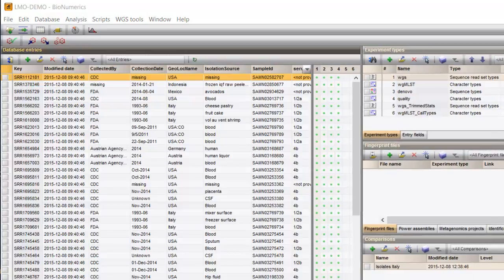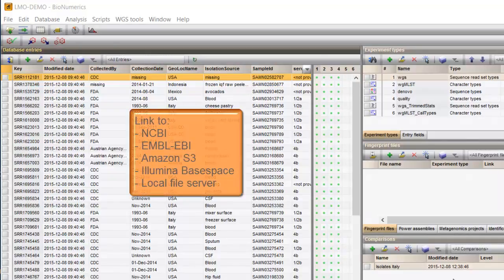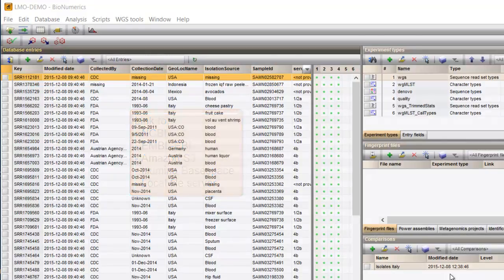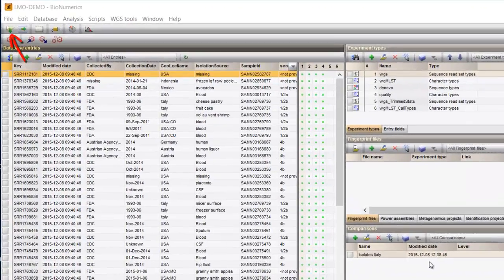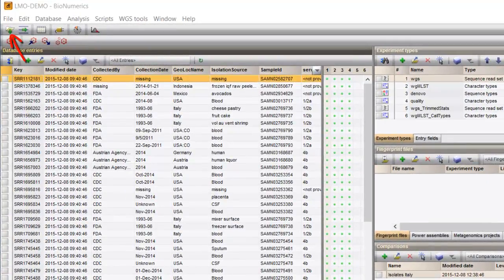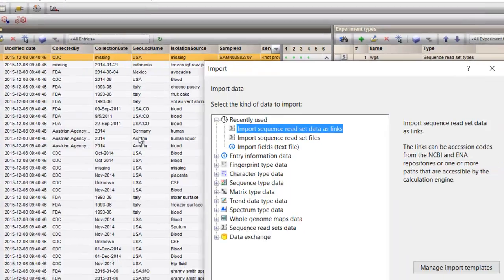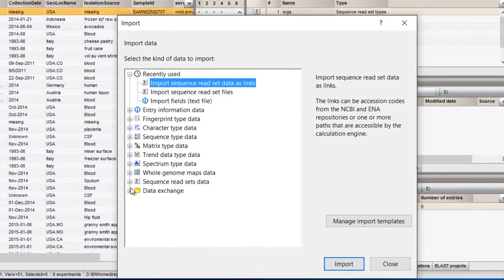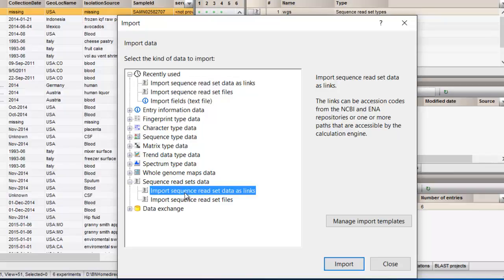Bionumerics can link to batches of sequence read sets from either NCBI or EMBL, Amazon S3, Illumina BaseSpace or local file servers. The way to proceed then, is to follow the import wizard, to sequence read sets data, import sequence read set data as links.